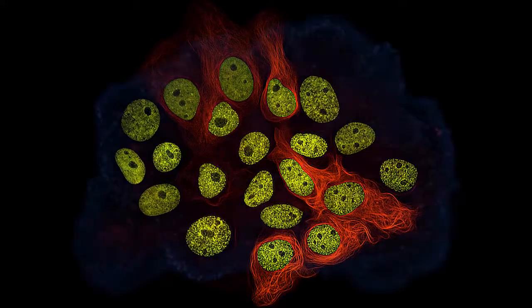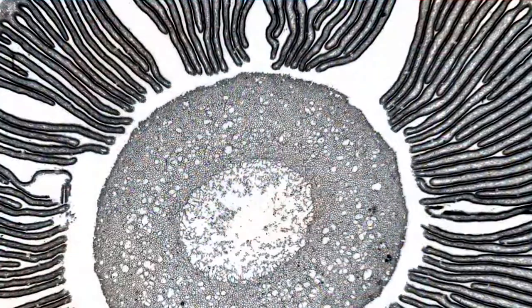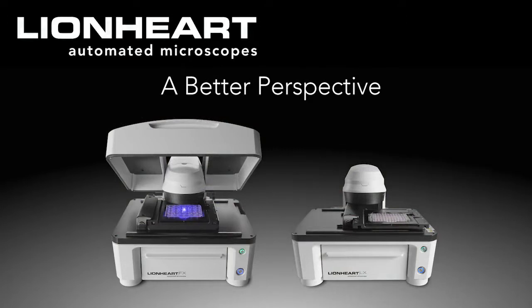Lionheart brings your science to life, capturing spectacular images, Z-stacks, montages, and time-lapse sequences with ease. Lionheart Automated Microscopes offer a new perspective, a better perspective, that will help your laboratory reach its research goals.